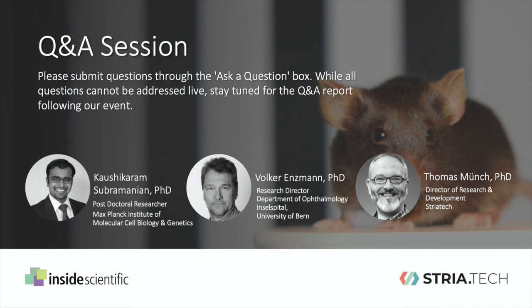Okay, I just would like to mention two. The first one is when you do manual observation, the experimenters actually have to be trained quite extensively, because it is not so easy to distinguish between the reflexes you would like to measure and compensatory movements of the whole animal.